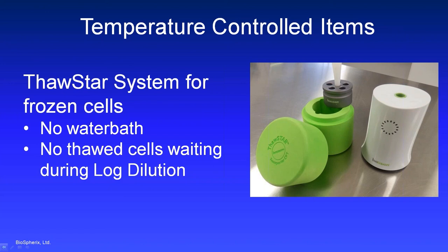And all of these can be disinfected. So it makes it a particularly good system to combine with your Xvivo for keeping cells frozen all the way until they get inside the system and then thawing them in place.